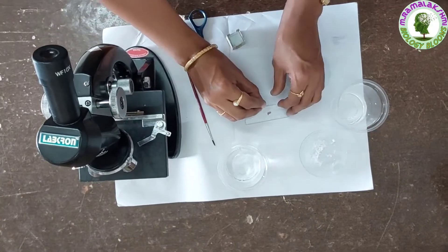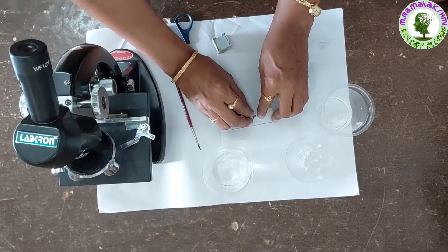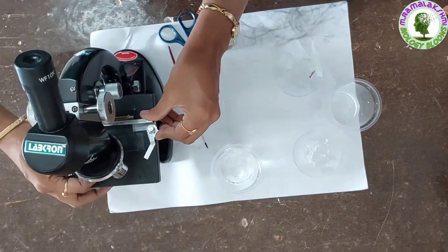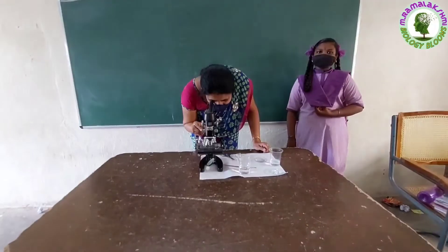After 5 minutes, cover it with the cover slip and place it under the microscope. Now observe it.